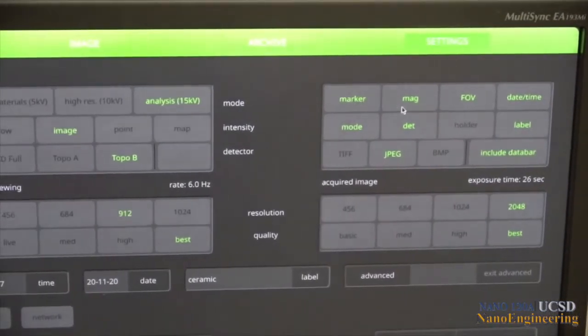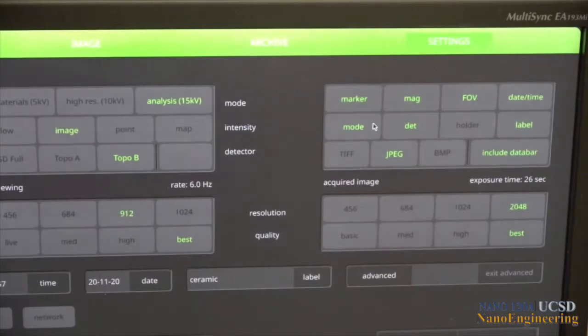The menu boxes on the upper right in the settings mode show a variety of information that can be included in your recorded images. These could be measurement markers, magnification information, date and time, the mode—that is the accelerating voltage—the detector, backscatter detector full, topo A or topo B, data bars, and any labeling information you want to include. Each can be clicked on or off as desired.